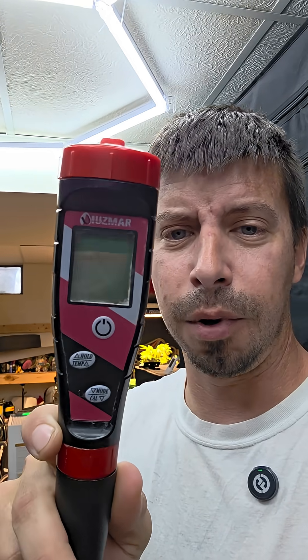So if you're looking for a good cheap EC meter, pH meter, parts per million meter — all-in-one TDS — I recommend getting the Yuzmar.